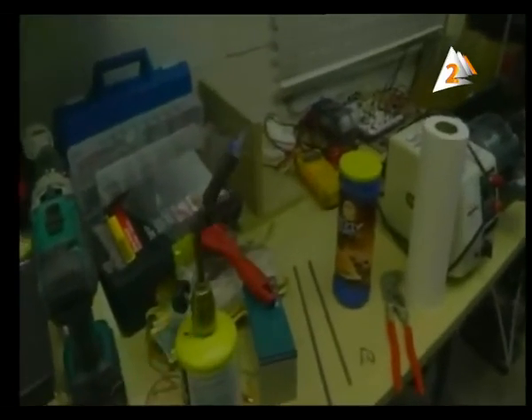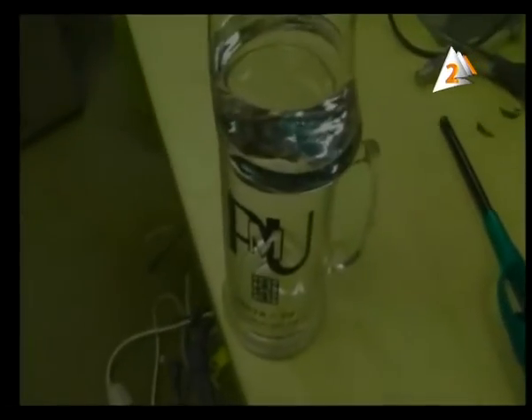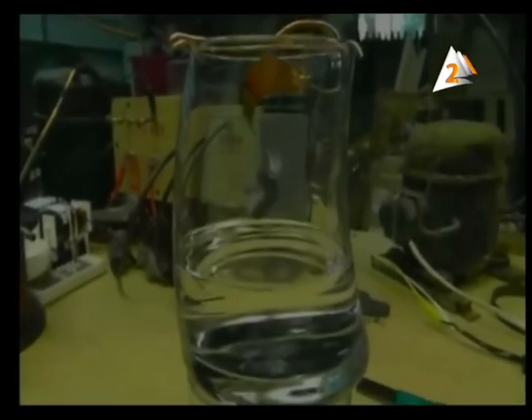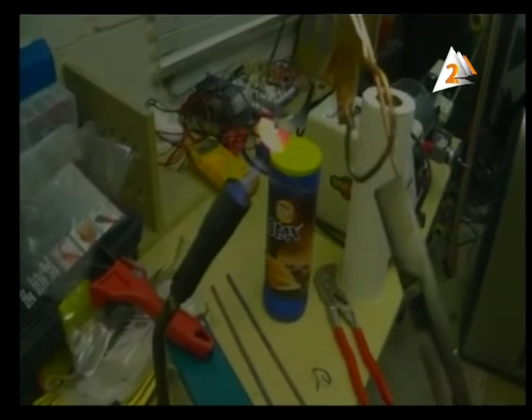What about if it starts to work now? What happened here? Here we have the reaction between the copper piece and what? And this sheet. Put it inside the beaker of the acetone, and after some time we have what? The acetone is the flammable material that makes the reaction between it and the copper. How come? The reaction here has not started yet. We have the copper, there is no reaction. It must be heated to be active for the reaction.